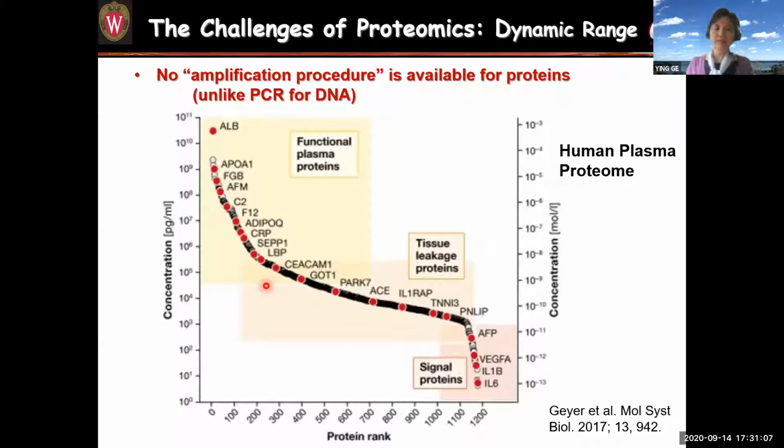And recently, we've been very interested in, of course, detecting troponin I. This is my favorite molecule from blood. But as you know, in the blood, as I said, it is extremely challenging because of the highly abundant albumin, right? So we all know albumin is the dominating protein in the blood.